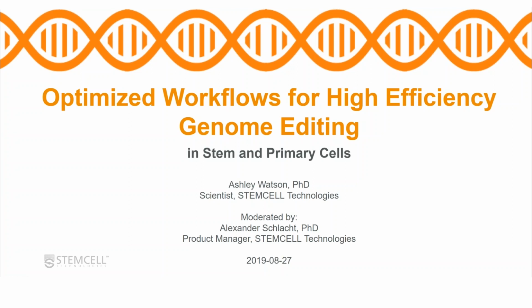I'm going to be telling you about some optimized workflows that we've developed here at STEMCELL Technologies to obtain high-efficiency genome editing in STEM and primary cell types. I'm going to begin by giving a brief overview of CRISPR-Cas9 and its use as a genome editing tool.